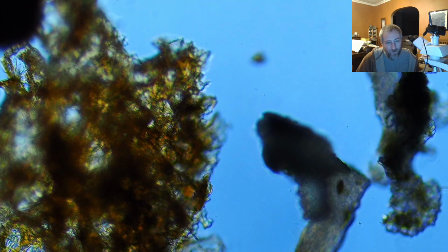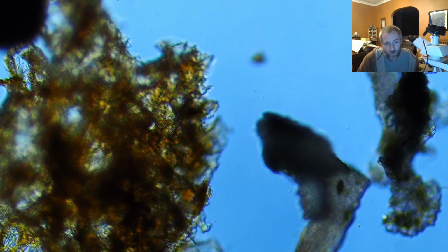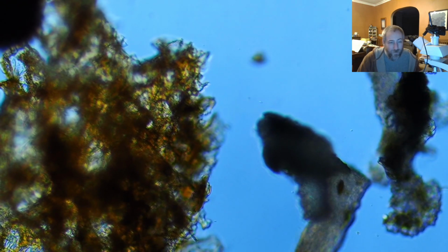That number sounds really impressive, that there's more than 1,000 species of water bears. Just want to follow that up with: there's more than 1,300 species in one genus of diatoms. I mean, there's thousands and thousands of diatoms. The species numbers for diatoms are estimated between 1 and 2 million, when it's all said and done. But we only have something like tens of thousands of them actually described.